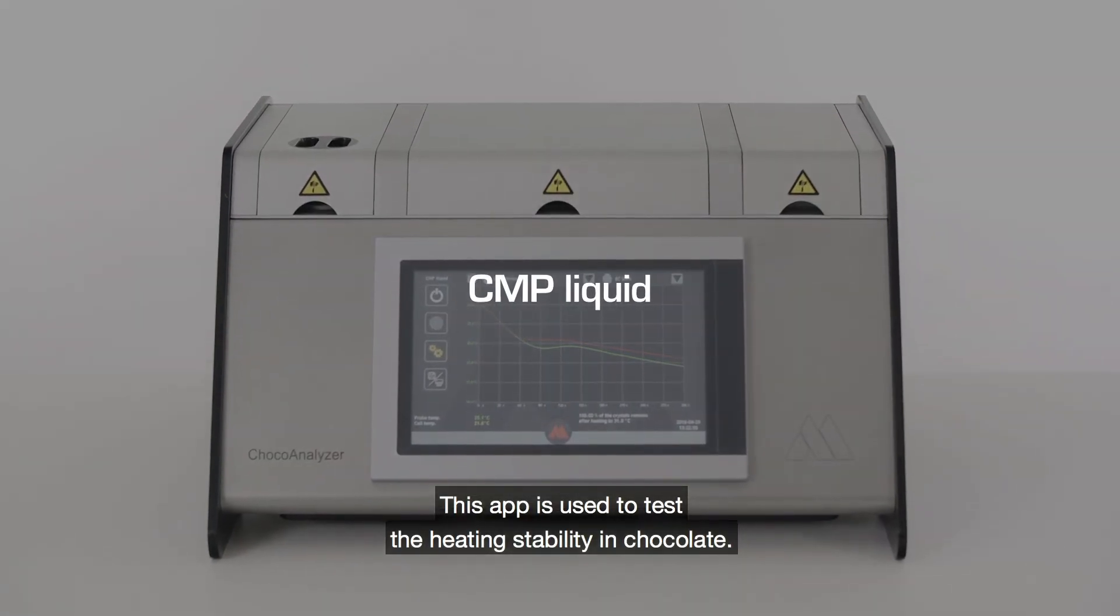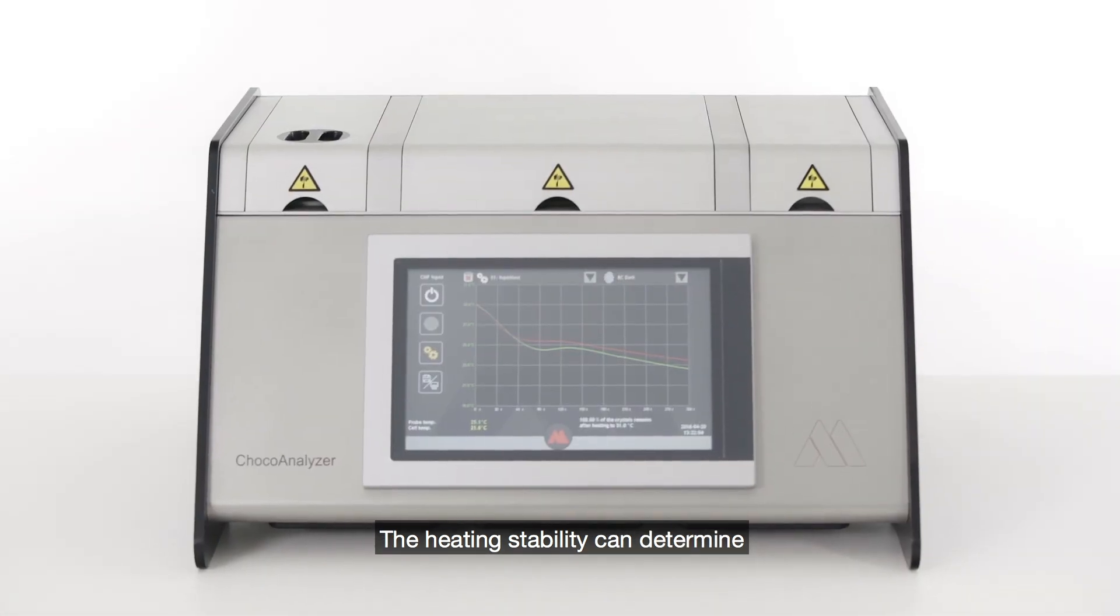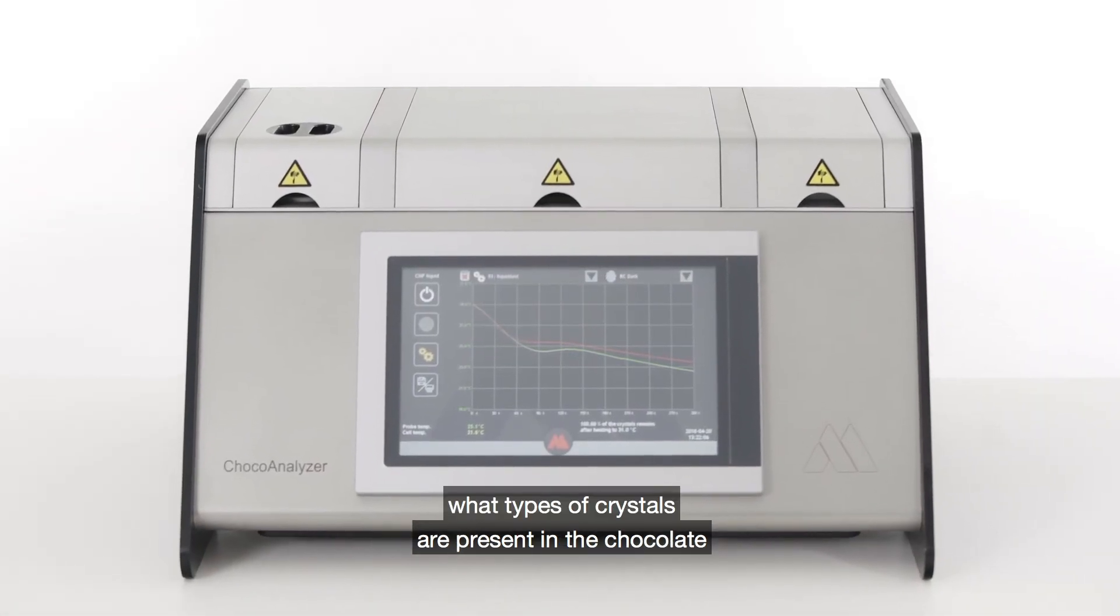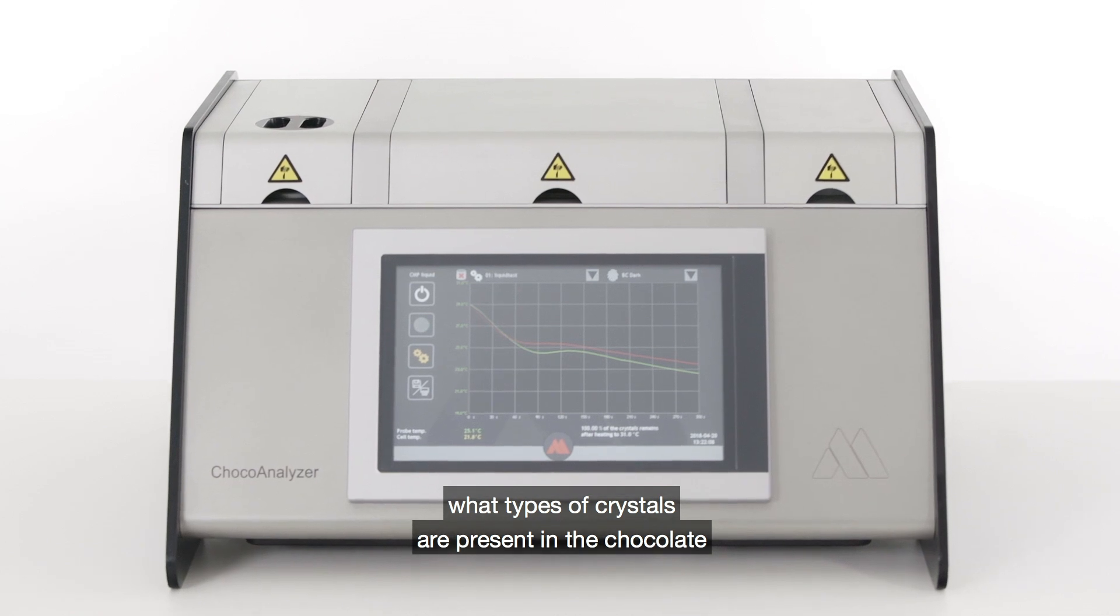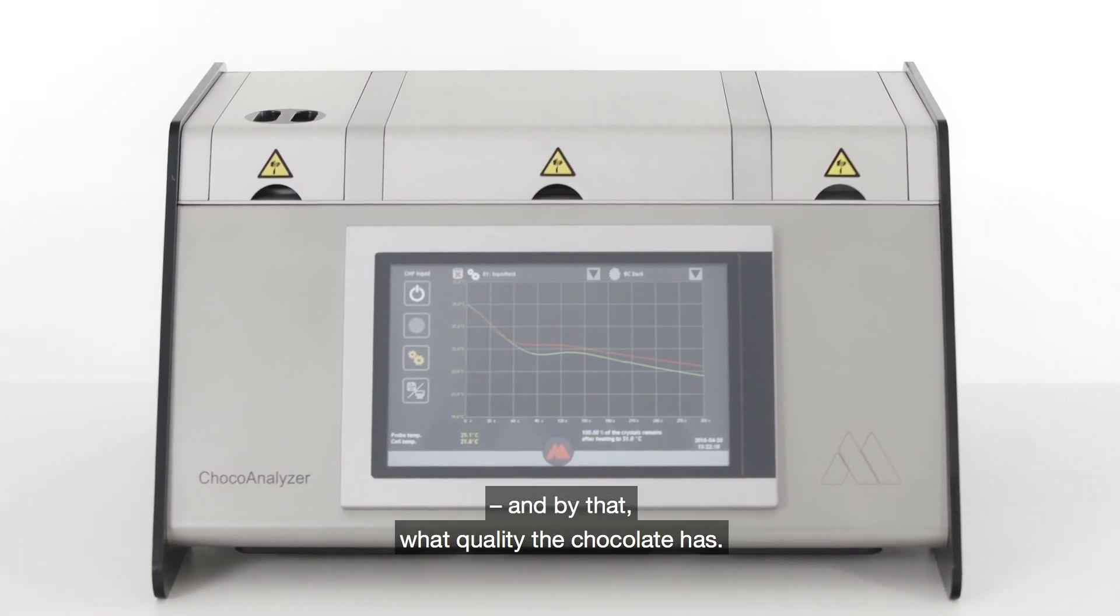This app is used to test the heating stability in chocolate. The heating stability can determine what types of crystals are present in the chocolate, and by that, what quality the chocolate has.